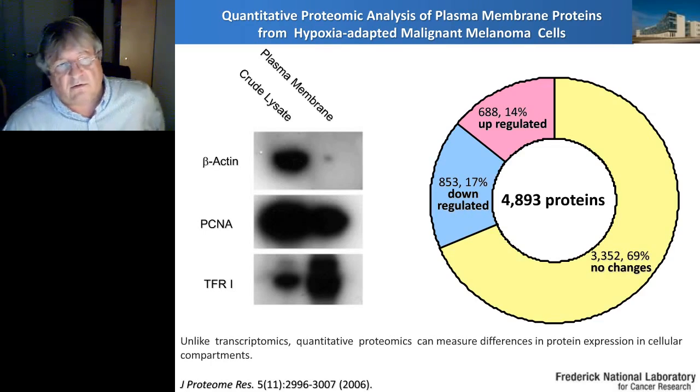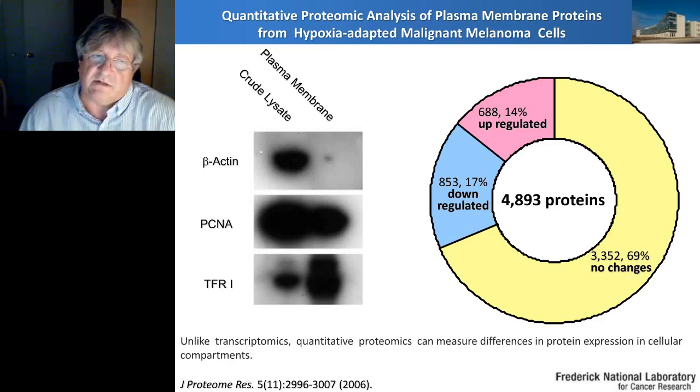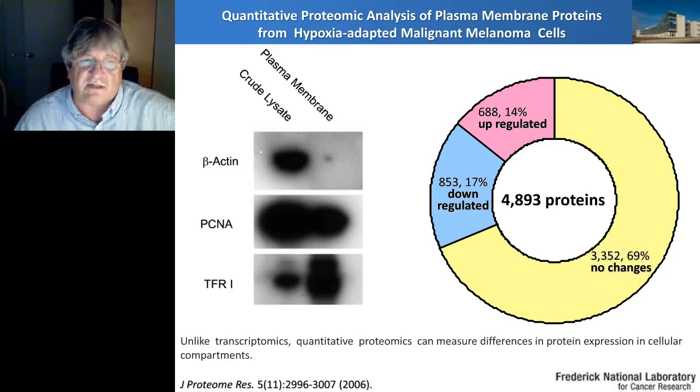So all those membrane preps are basically enrichment, not something where we can say we have pure isolation of an organelle, but enrichment definitely can help us to make enrichment and conquer dynamic range.